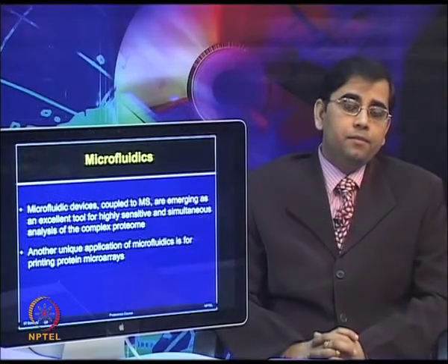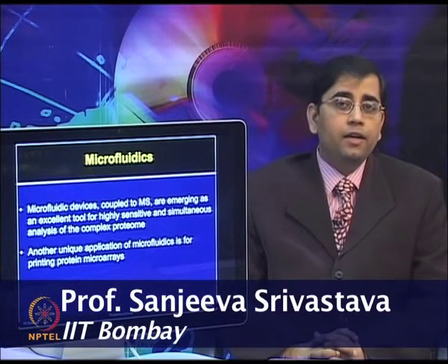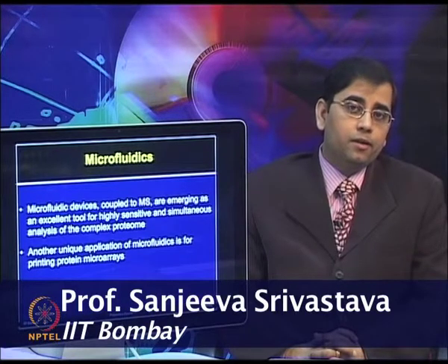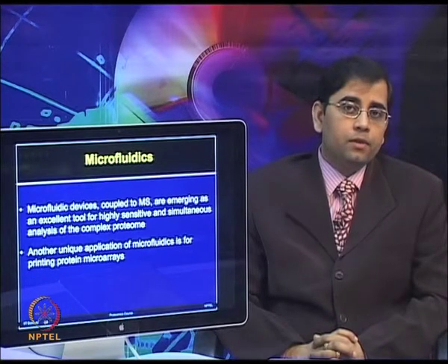Microfluidic devices are now increasingly applied in the proteomics field, and they are coupled with different types of proteomic platforms such as mass spectrometry as well as protein microarrays.